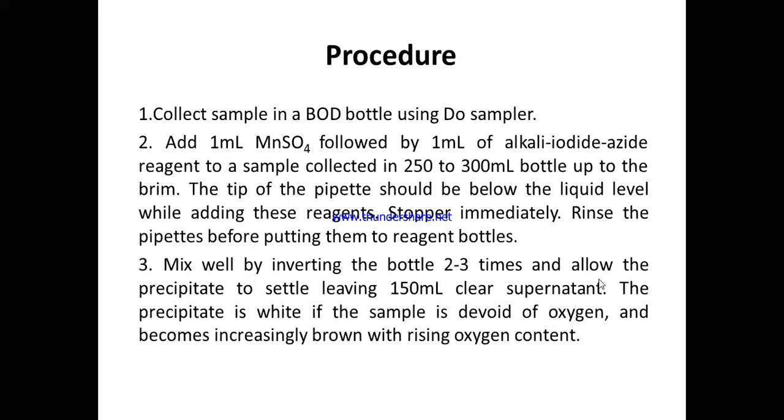when we see that clear supernatant is formed, यानी क्लियर लिक्विड लेयर टॉप में दिख रहा है, नीचे प्रेसिपिटेट डिपॉजिट हो चुका है. The precipitate is white if the sample is devoid of oxygen. तो ऐसा हो सकता है कभी कभी वो प्रेसिपिटेट व्हाइट कलर का दिखे, इसका मतलब डिजॉल्व्ड ऑक्सीजन लेवल बहुत कम है. Otherwise it will be brown in color.